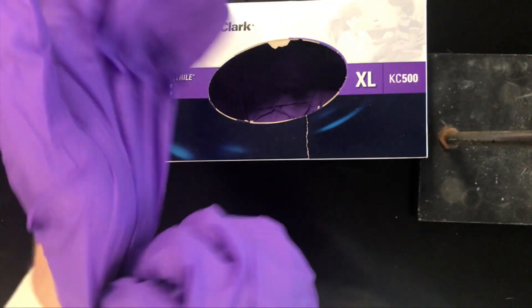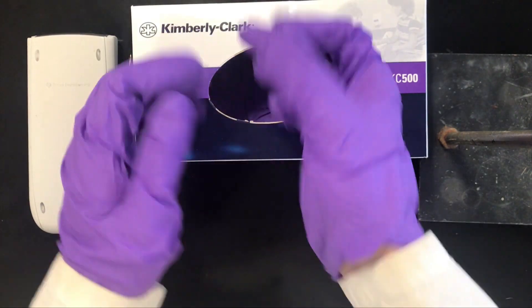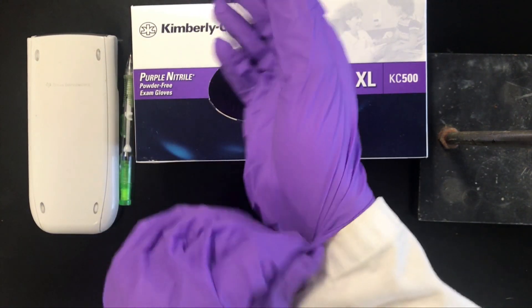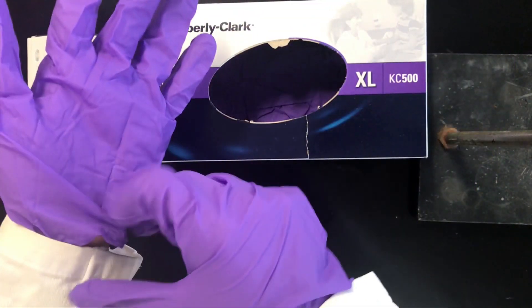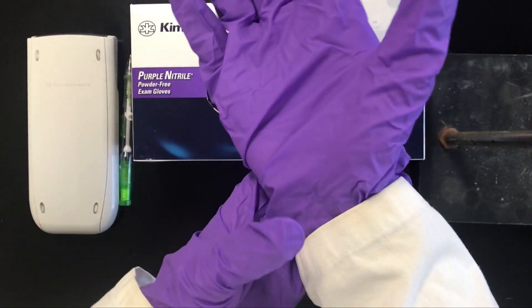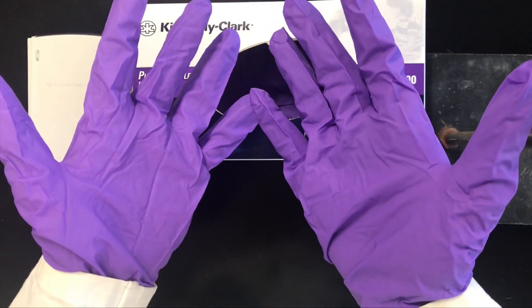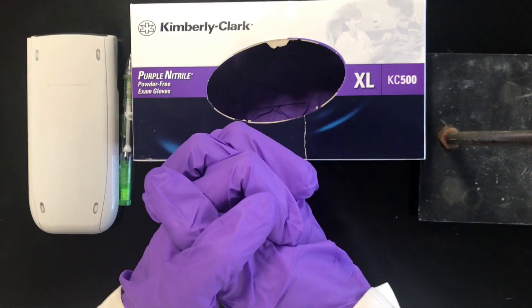I'm going to go ahead and put these on. One thing you should notice as far as putting gloves on is that with the lab coat and the gloves, ideally your entire hand and wrist should be covered, so there's no or very little exposed skin. In the near future, we're going to have longer gloves that go a bit further down the arm to ensure there's no exposed skin, which is key to avoid very common hand and wrist exposures.